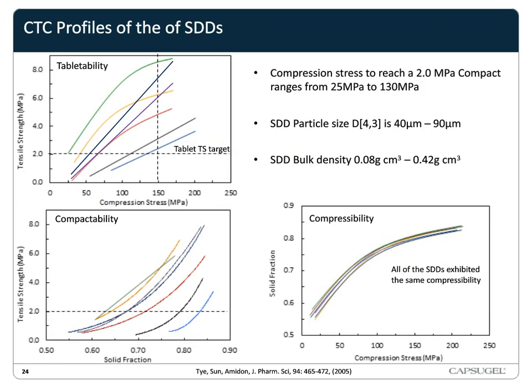Okay, so this slide shows CTC profiles of the resulting SDDs, and I think it's 7 of the 8. We generally use CTC profiles to aid in tablet formulation design and assess scale-up risks. CTC stands for compressibility, tabletability, and compactability.